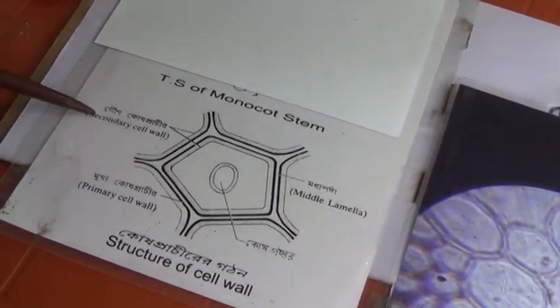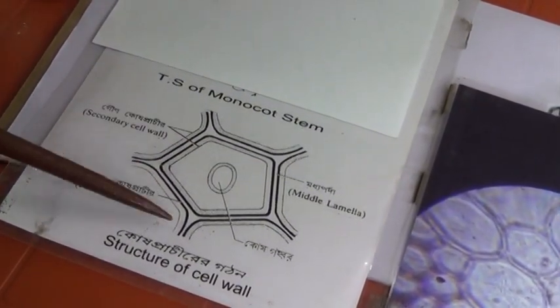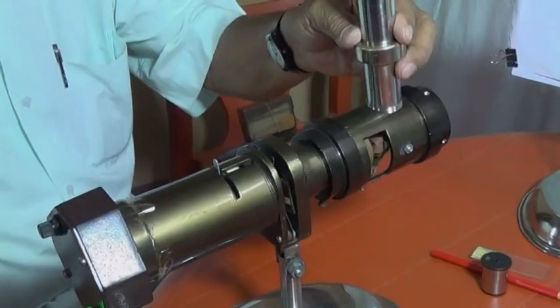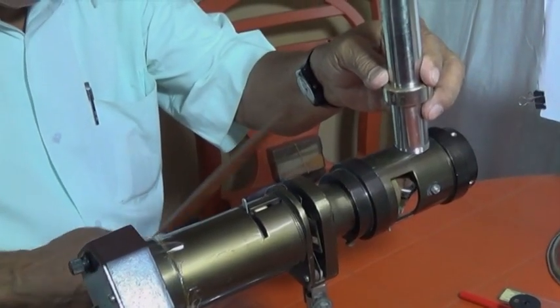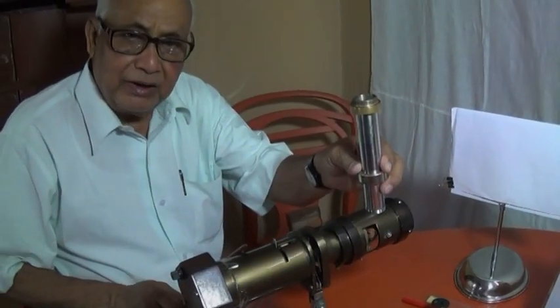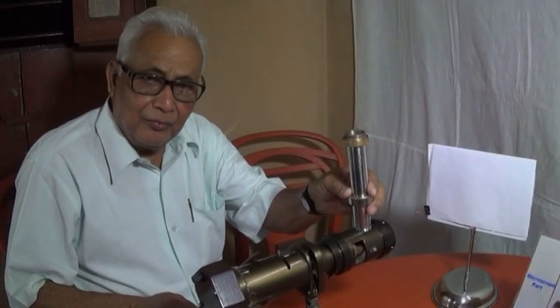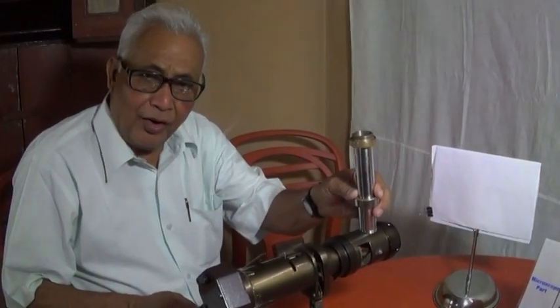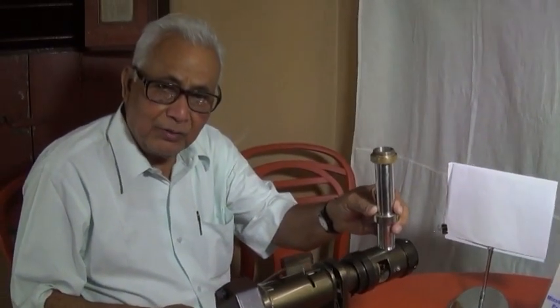This two-in-one microscope come projector is very useful as a teaching aid for bilingual students of school, college, university, even research lab. Thank you.